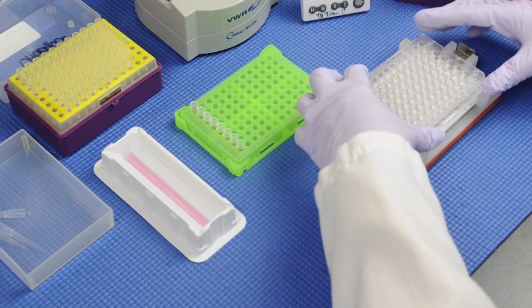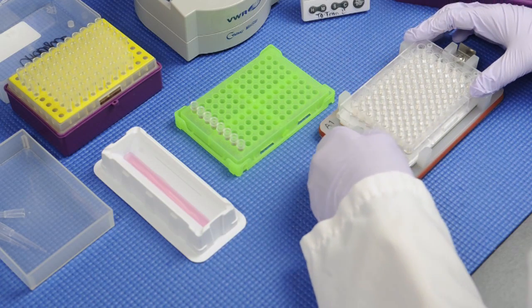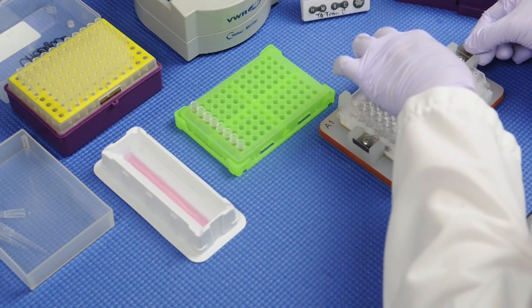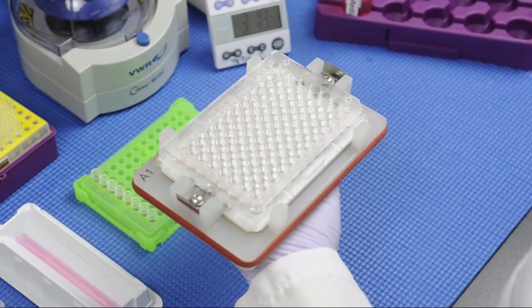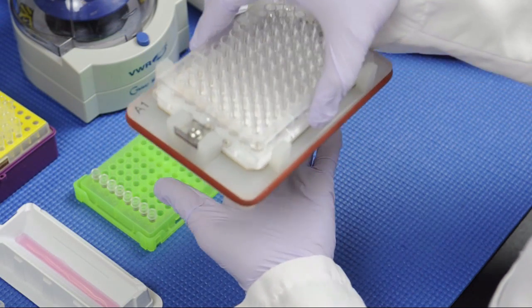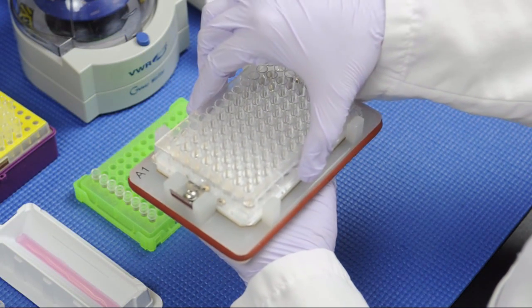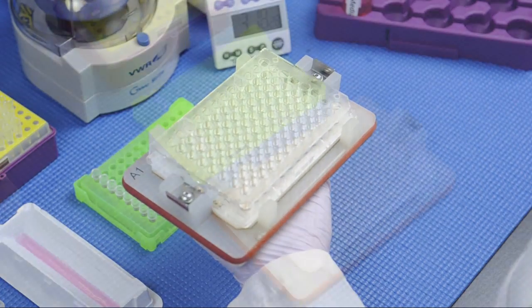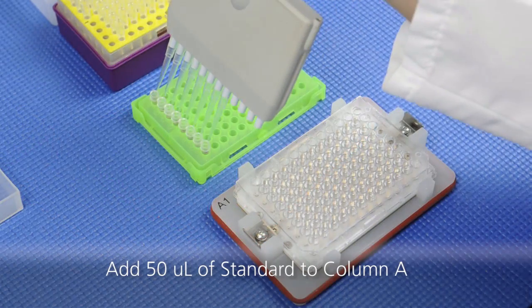Insert the 96-well plate into the handheld magnet and lock the plate into place with securing tabs. Ensure that the plate is locked into place by gently pulling on the 96-well plate. For this tutorial, the magnetic beads were previously added to the plate and washed.